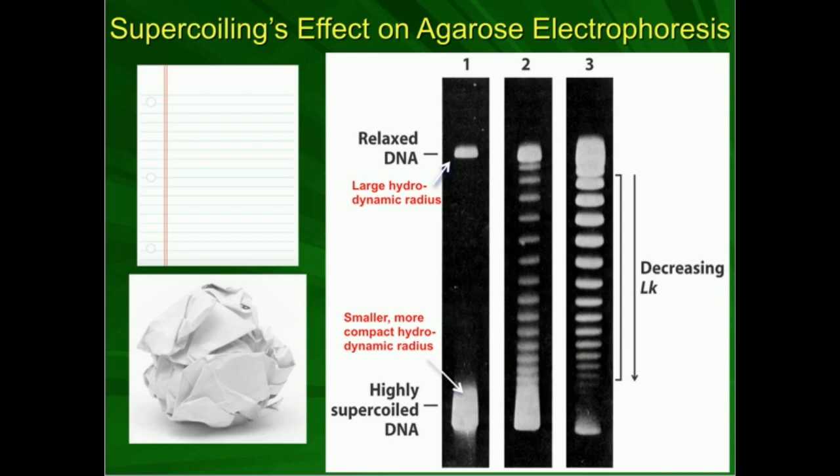So suppose I have two DNA strands. They are exactly the same DNA strand, same sequence, same everything. They're identical, except in one way. One of them is a relaxed DNA strand and the other is highly supercoiled. They're the same DNA strand, however they have different levels of supercoiling. Meaning if you were to look at their three-dimensional structure, they would look different. In other words, their topology is different.